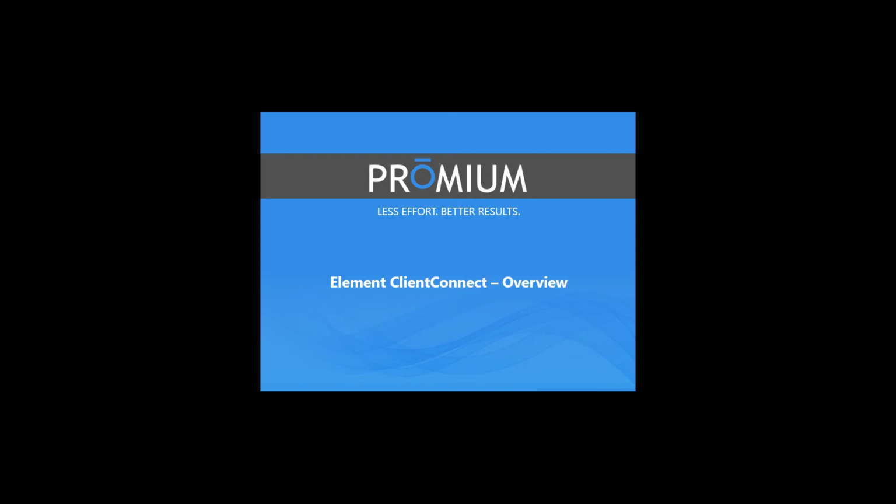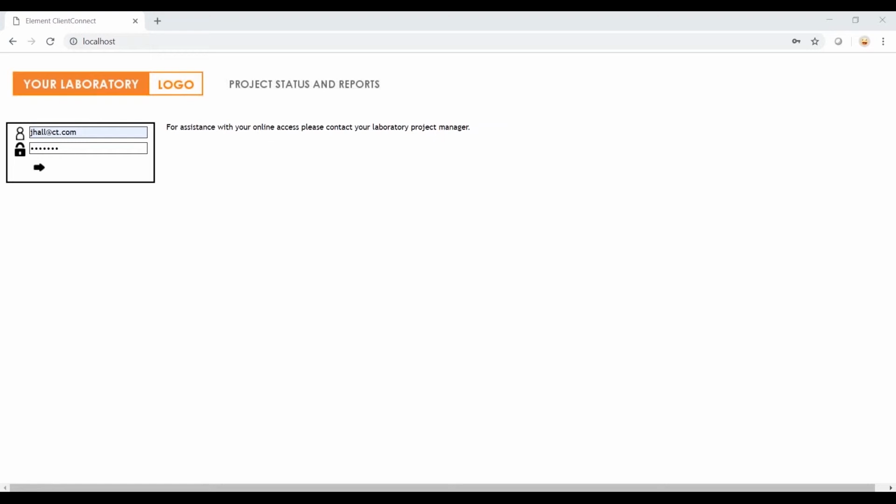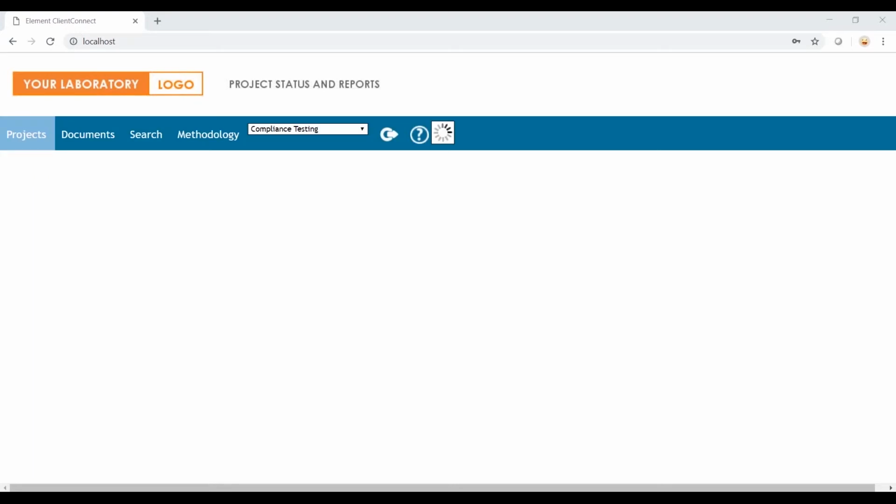In this video, I will walk through an overview of ClientConnect, which provides laboratory clients with access to information related to submitted samples. ClientConnect is a methodology for a client of the lab to view results, check sample analysis status, download reports, and review methodologies set up in the laboratory's LIMS system.